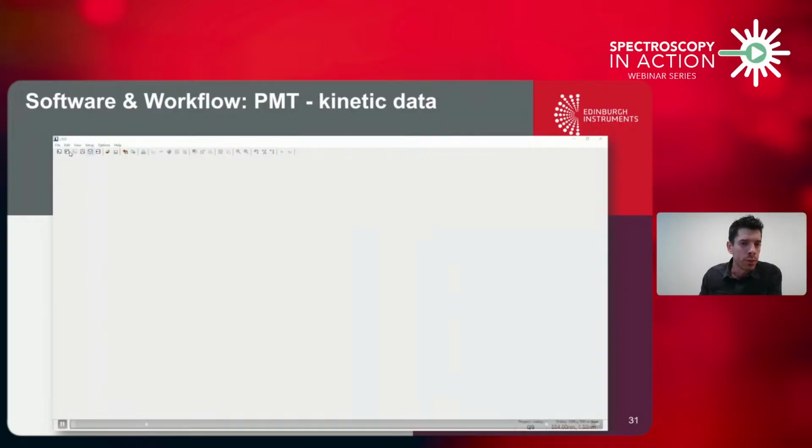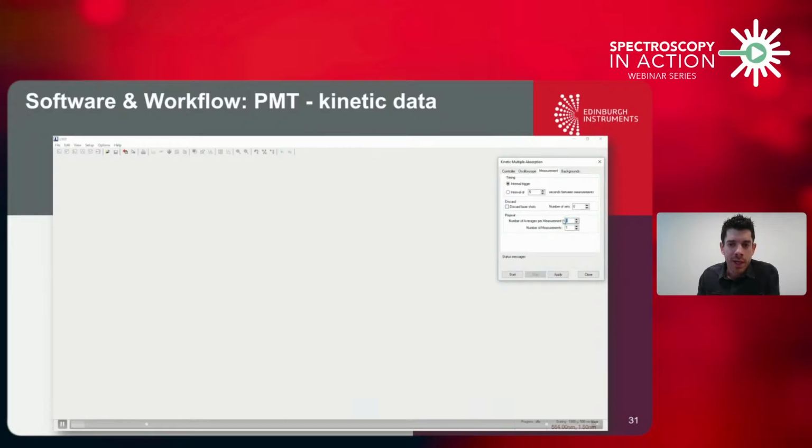So now I go onto these two buttons. I go to absorption for the PMT. I change the number of iterations to 20, and I'll show you how to do that. From here, essentially, these are the oscilloscope parameters. And from here, essentially, I change the parameters of the laser and the probe beam. I have chosen fluorescence background to be excluded, and I start the measurement.